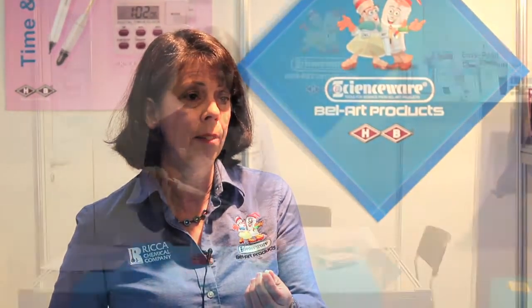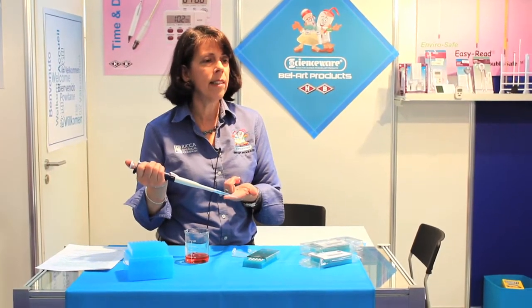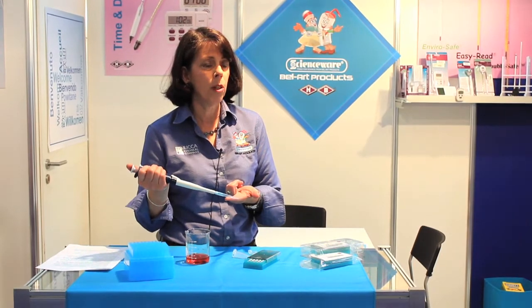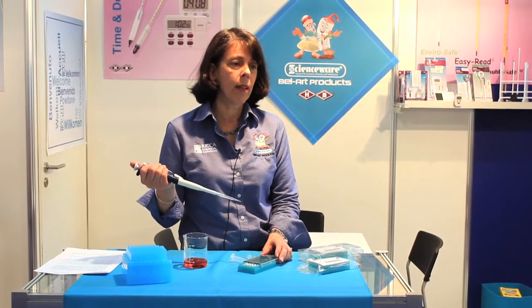The result is FlowMe — a 40 micron porosity filter that's designed to take the cellular debris out of your samples without retaining your sample and precious cells. FlowMe fits directly onto the end of a P1000 pipette tip, making it natural to your workflow. Let's take a look at how FlowMe works and then we can get into some of the details.